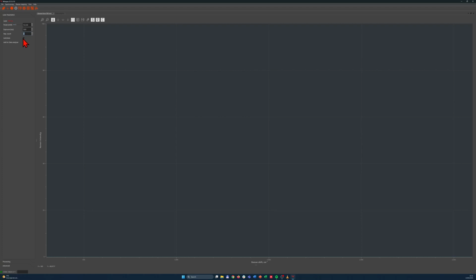Then we can have auto saving to a specific folder. When we acquire, you can choose the folder, the name of the files, and you can choose an option whether to add a reference spectrum or not, and the folder name over here. Let's cancel. And let's enable the option into data analyzer. Usually when I'm working, I'm saving the data to the data analyzer, and then I'm saving it manually after some preprocessing. We'll also cover preprocessing in this video.